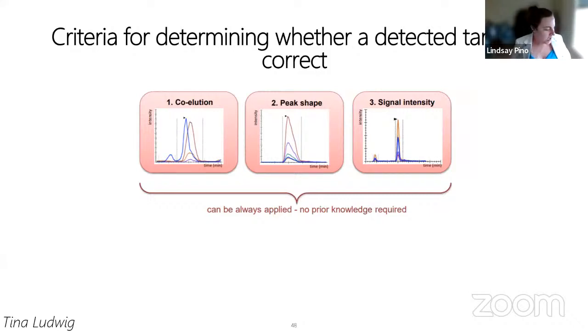And what we're going to be doing today, hands-on, is going a little bit more into what it means for a chromatogram to look good. Because as you're going through this May Institute, if you're sticking around and doing more of the statistics, garbage in, garbage out, right? There's no statistics in the world that will save a bad data set if the data set itself is bad. Can't massage biology into a bad data set.